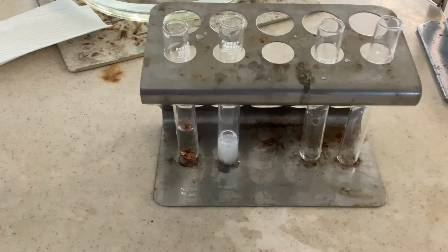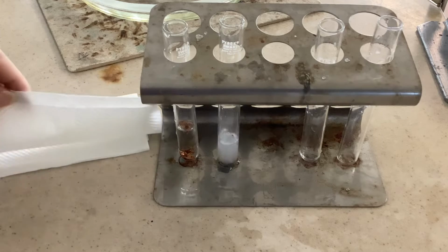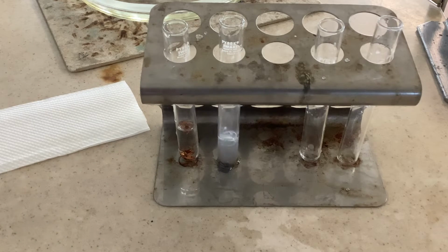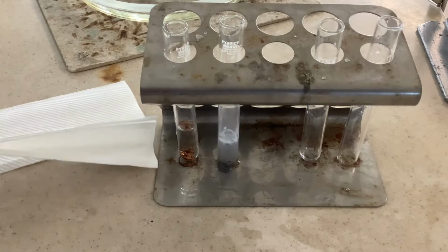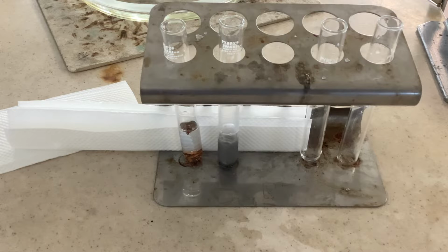I think you can observe something already: for copper metal, there is no observable change up to this moment. However, for the calcium, it shows something already. There are some gas bubbles, and originally the water on the top is a colorless clear solution. However, now it becomes somewhat milky. And if you listen carefully, you can hear some hissing sound.